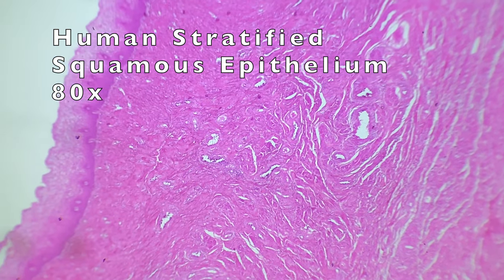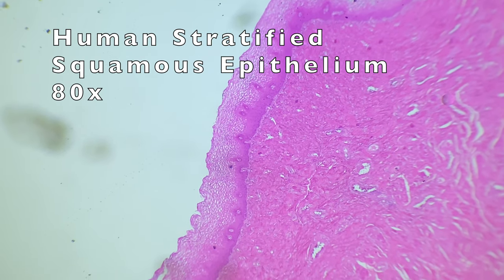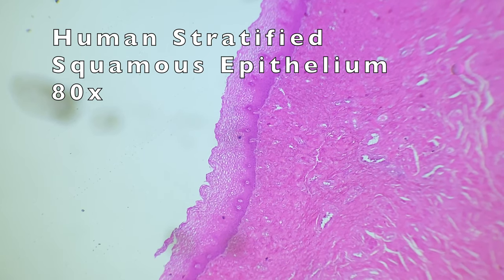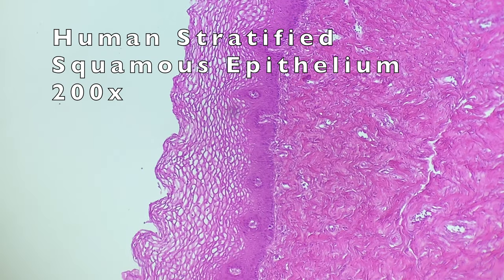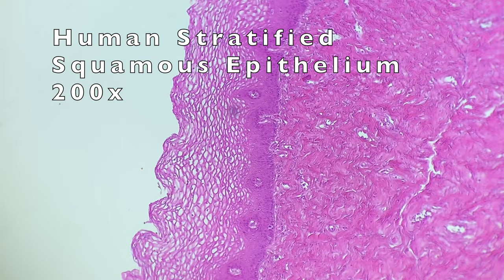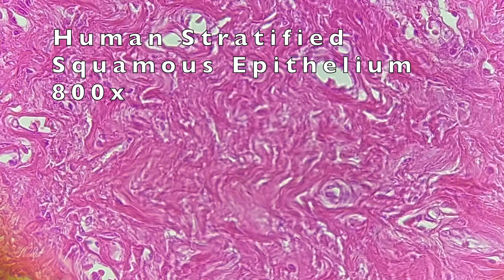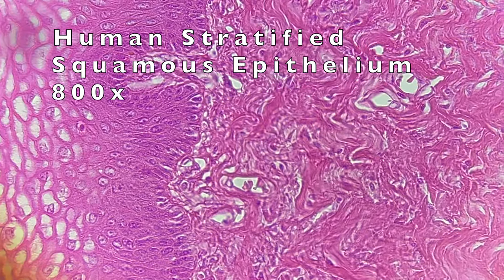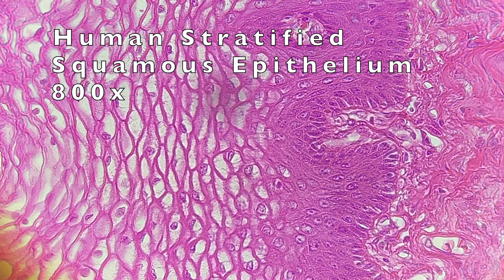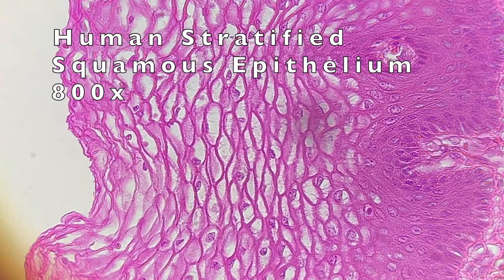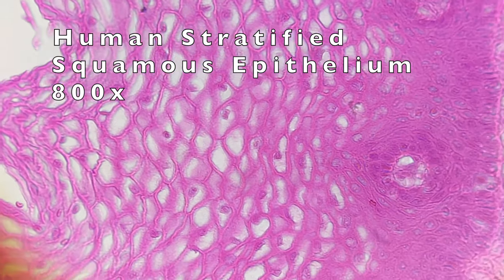Here we see stratified squamous epithelium in the human body — you find this on your skin as well. Your skin has to be very tough, so it'll have multiple layers of this stuff. But we are lacking pigment here. I believe what we are looking at is most likely the esophagus or part of the throat, because we have multiple cells on the inner portion, but the cells are mostly empty and are probably not producing any product.